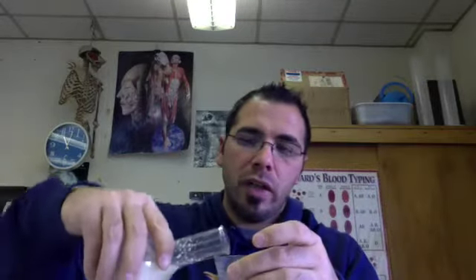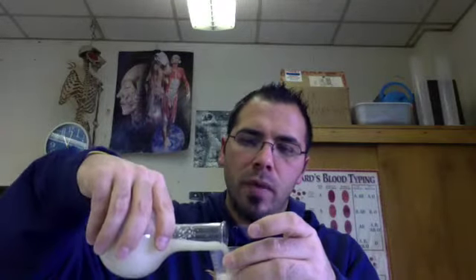You're going to fill them up. You can do that test tube. I don't care what you do on that chart where it says test tube 1 glucose sucrose. Just make sure you know which one is which. Then you're going to finish off the rest of the test tube with your yeast solution. What I mean by finish off, I'm going to pour some of my yeast solution in here. It's been warmed up. And what I mean by finish off, you're going to top it off.